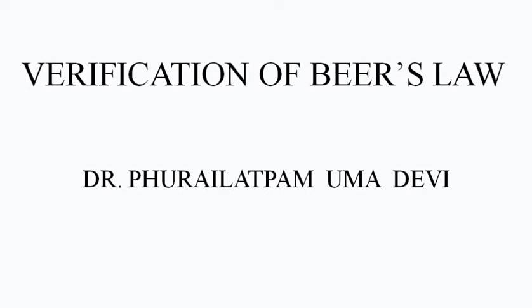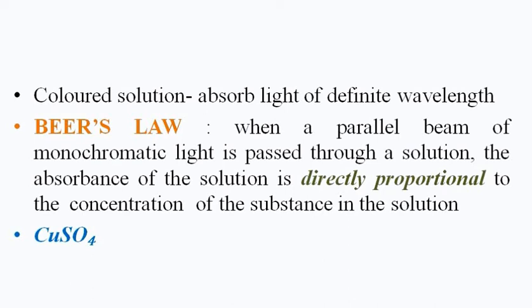Hello everyone. Today's practical class will be on verification of Beer's law. Colored solutions have the property of absorbing light of definite wavelength, and the amount of light absorbed or transmitted by a colored solution is in accordance with the Beer-Lambert law. But today we are going to focus on Beer's law.